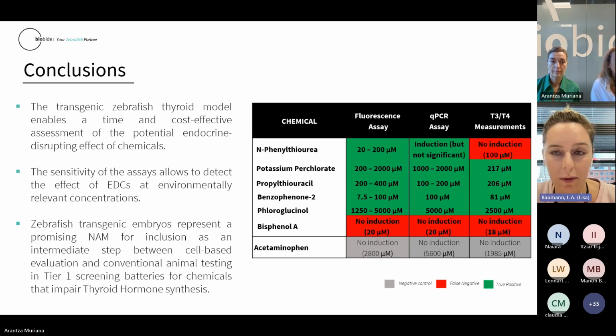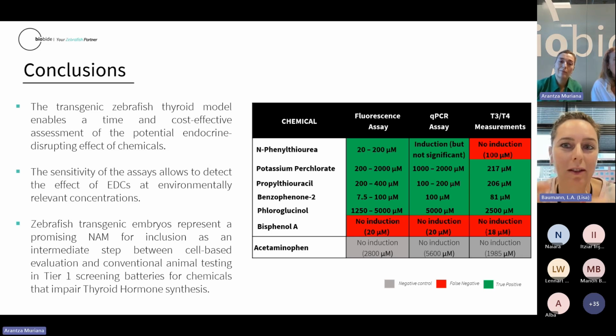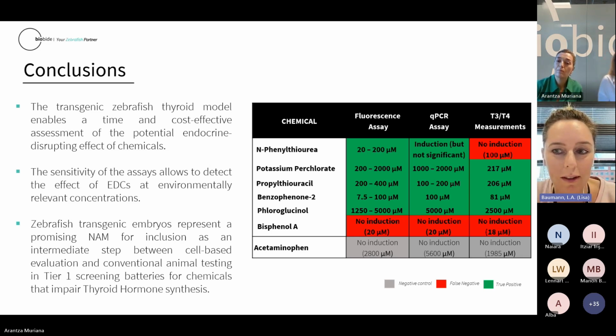Oh, okay. That's really good, because what we observe is that, of course, also the size of the follicles changes. I mean, you can see it somehow as a replacement for histopathology. Also, the shape, the morphology of the organ is important to assess, and this also has an impact on the fluorescence intensity. And this makes this assay such a good replacement for higher tier test studies.